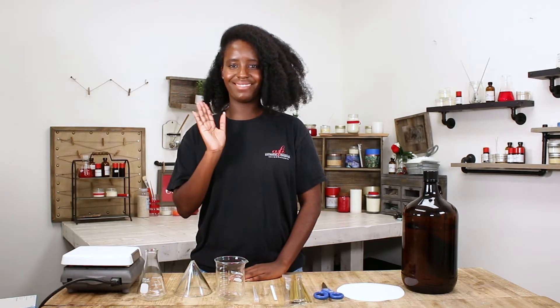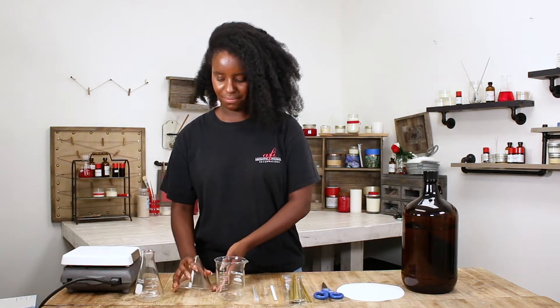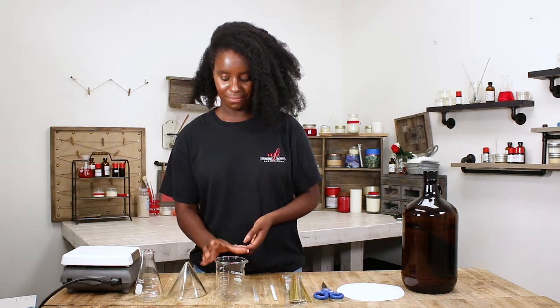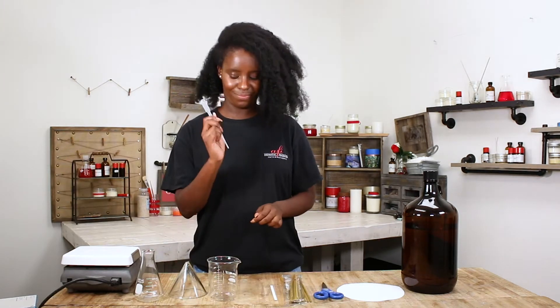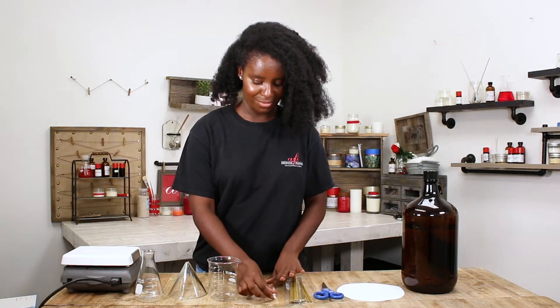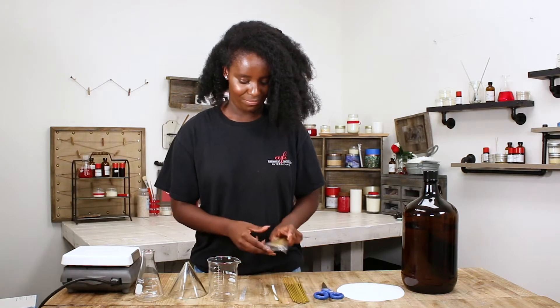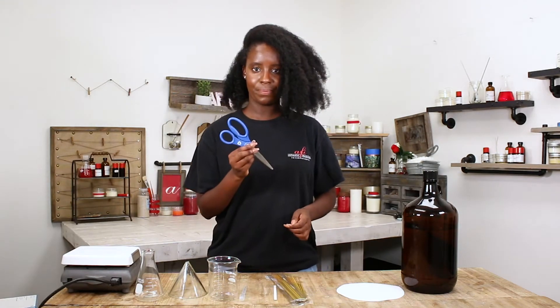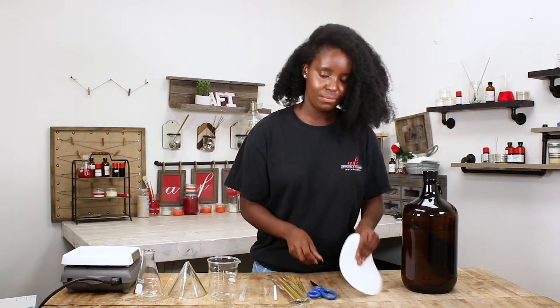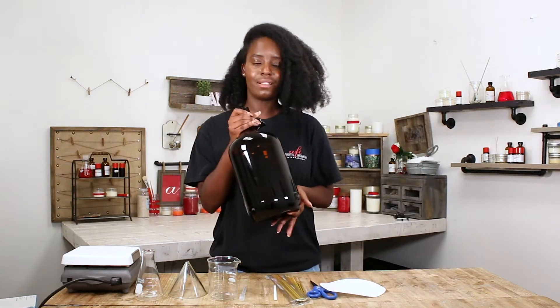For today's project we'll be using a flask, a funnel, a beaker, a pipette, a boiling stick — if Shamil can get it off the table — your incense, some scissors, filter paper, and some pentane.